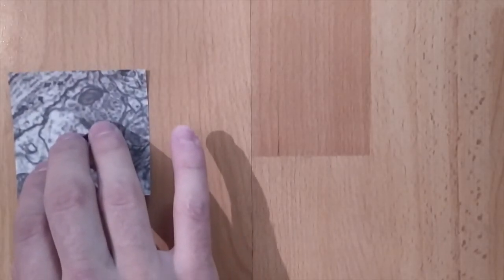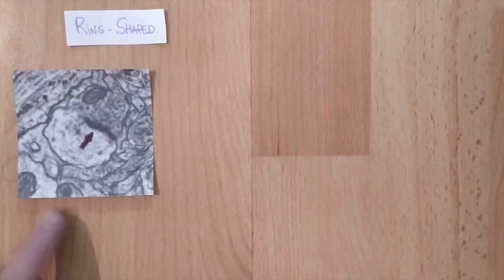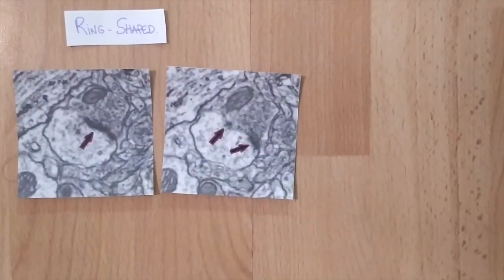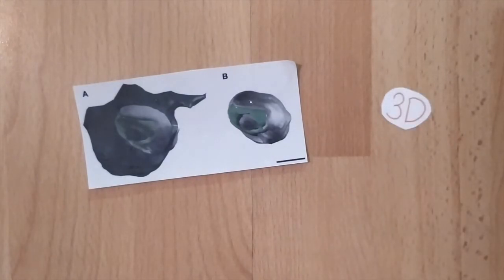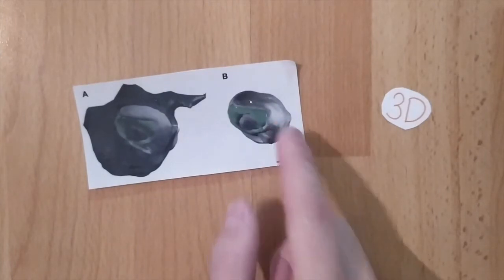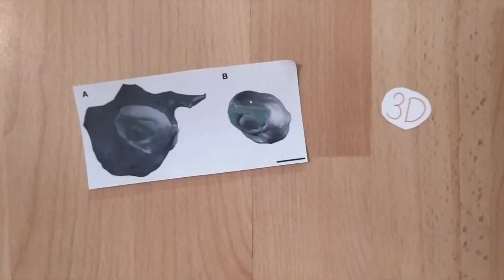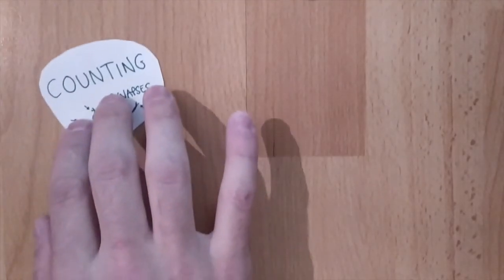You can see that the synapses, pointed here with arrows, has a specific organization called ring shape. The synaptic junction seems in one part at the beginning, then split to get back in one part in the end. Now, this is how it looks in 3D. Clearer now? Here you have the axon terminal, the synaptic junction, and here the dendrite. This approach helped them to understand that this synapses was a perforated asymmetric synapses, and this wouldn't be possible without this technique.